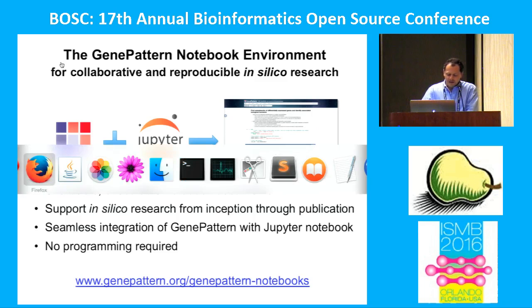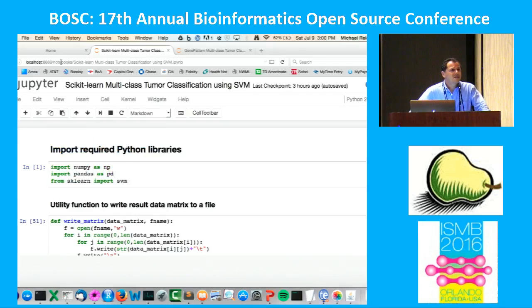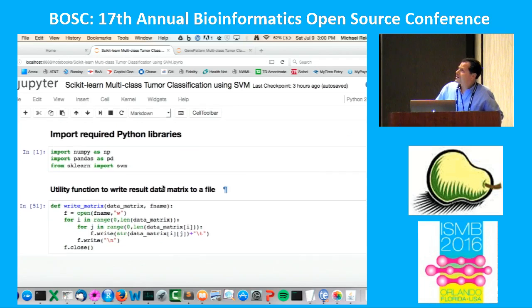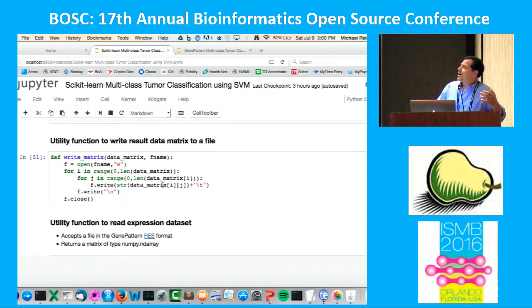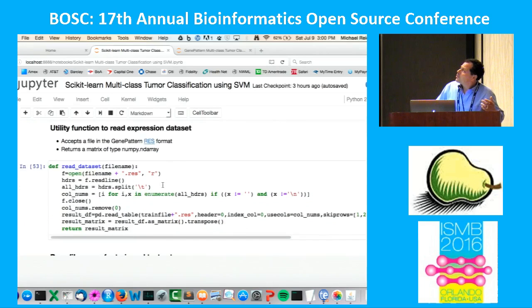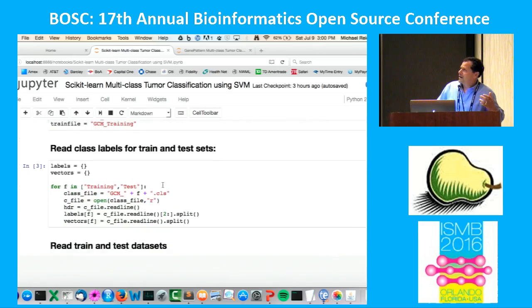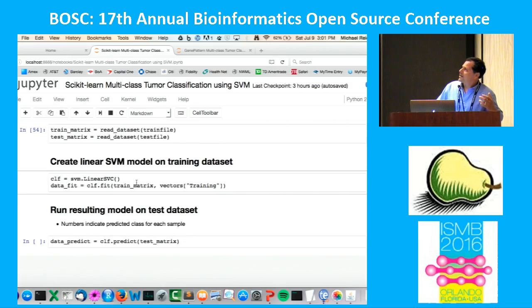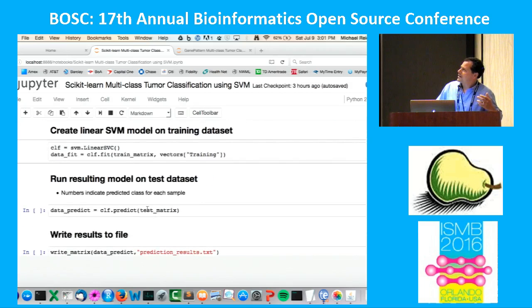I'm going to show you two notebooks that implement the same analysis: taking a dataset of 14 different cancer types, training a support vector machines model to create a predictor, and then running that predictor on a separate test set. Here is a Jupyter notebook doing this via straight Python code. We need to import required Python libraries, utility functions to read and write data, read class label datasets, read train and test datasets, create our SVM model on the training dataset, and run the model on the test dataset.